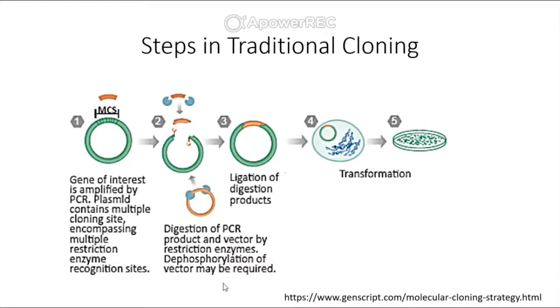Okay. So, and you can ignore this dephosphorylation step. It's not important for the type of cloning that we're doing.